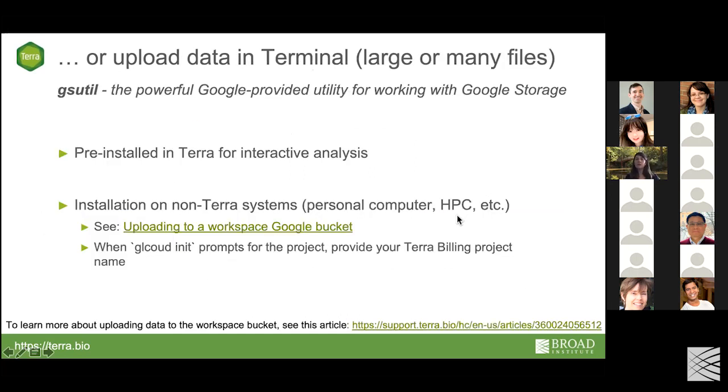But what if you're moving larger files, or if you're more programmatic, if you're more comfortable using command line, you can move files using GSUtil, which is the Google provided utility for working with cloud files. This is pre-installed in Terra for interactive analysis, and you can also install it on non-Terra systems, meaning you can install it on your personal computer, HPC, etc. This will be useful, again, for moving those larger files where you can provide a huge list of files that you want to move at once.